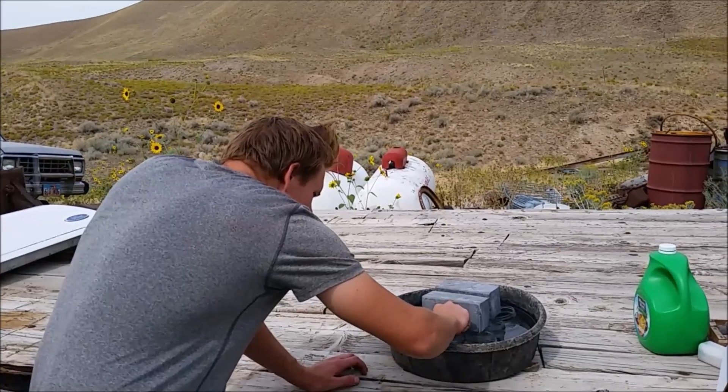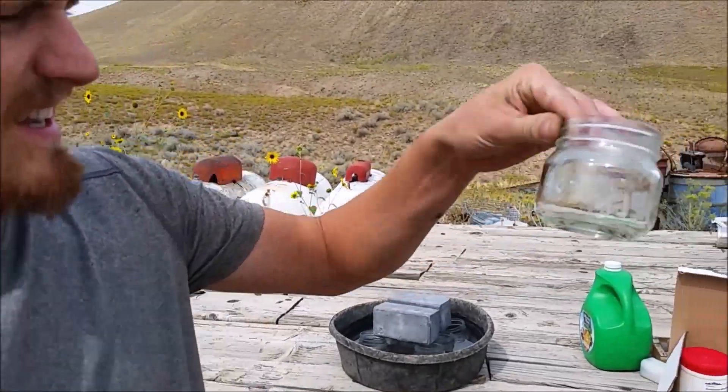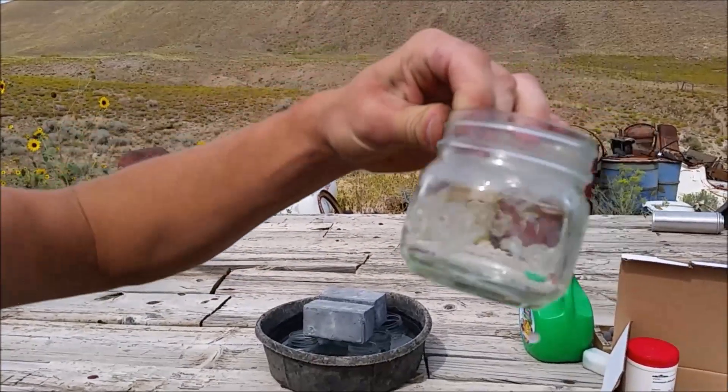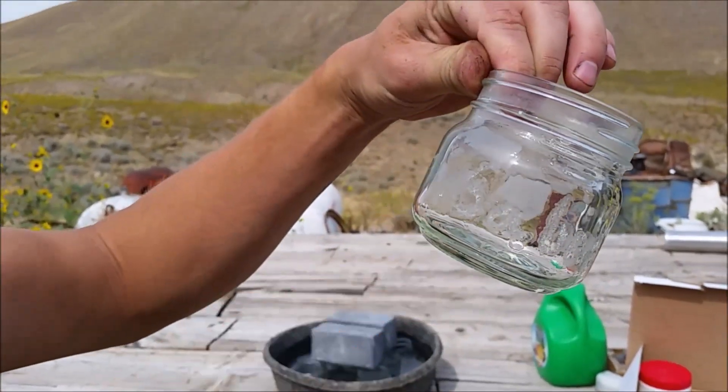Here we are, we're about three hours of etching. It's been eaten away at the glass. Let's go wash this off and see how good this looks.